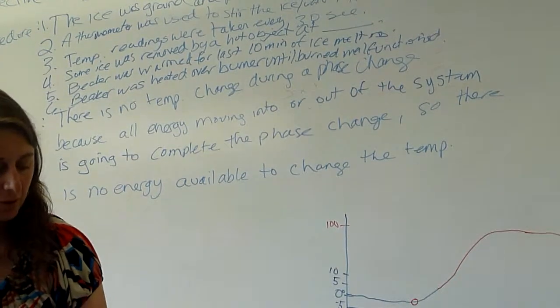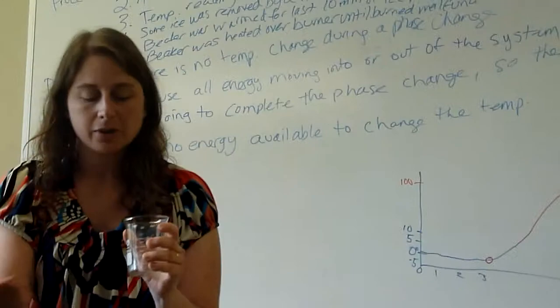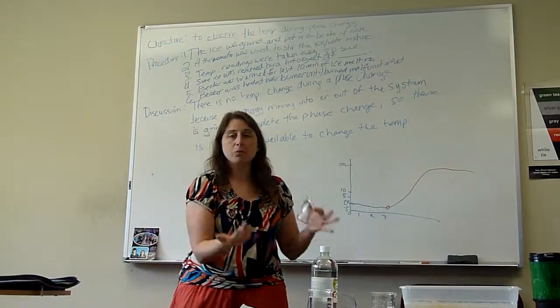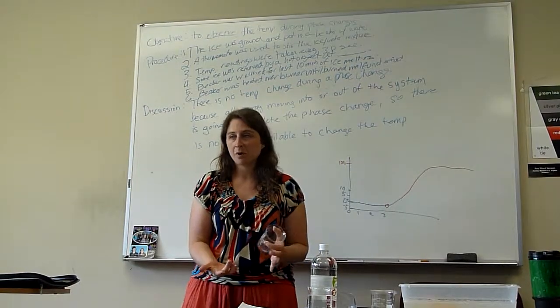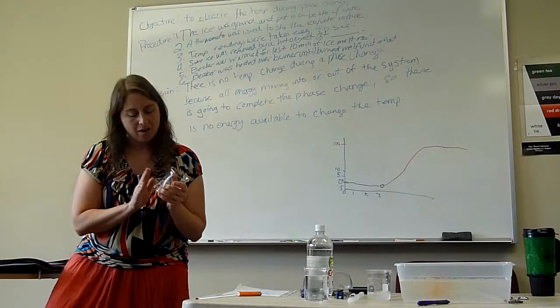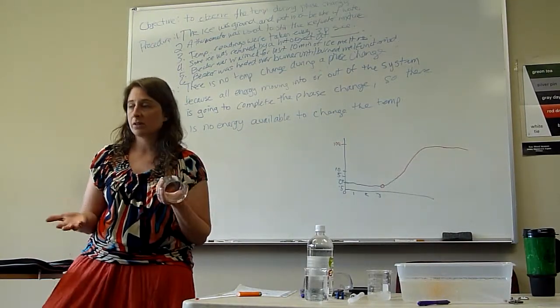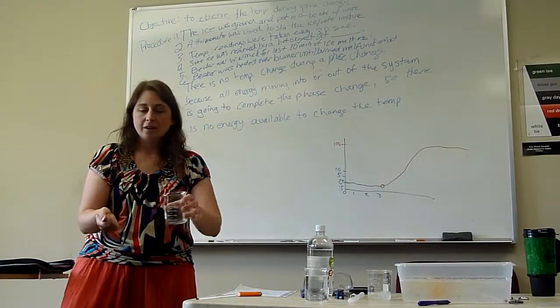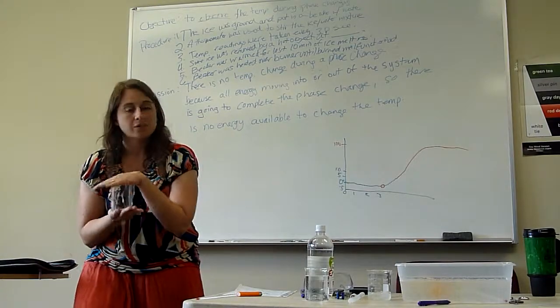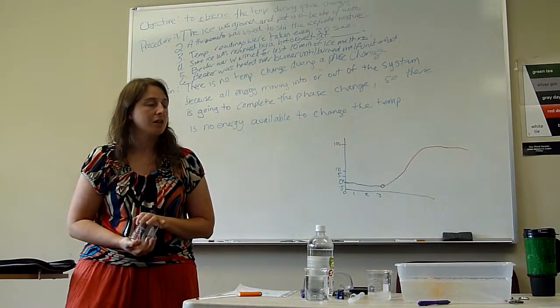The point of calorimetry is, so we'll have some water in here, and we know lots of information about the water. We're going to add some hot metal. We'll heat that metal up in boiling water. I'll actually have a new propane tank, so you can boil the water. And then that boiling water we know is 100 degrees Celsius. It will heat the metal to 100 degrees Celsius, exactly, right? And we'll put the metal into that water, so we know the temperature that the metal is, we can measure the temperature the water is, we can measure the temperature changes.